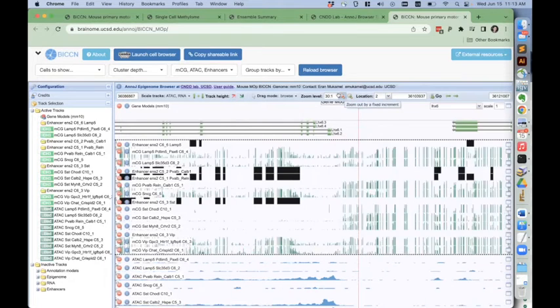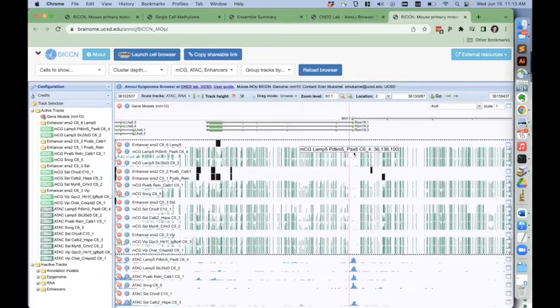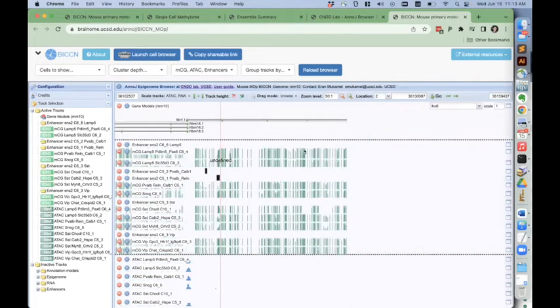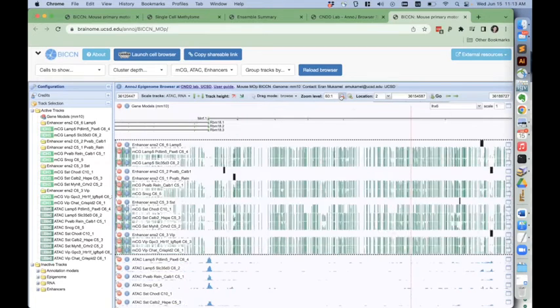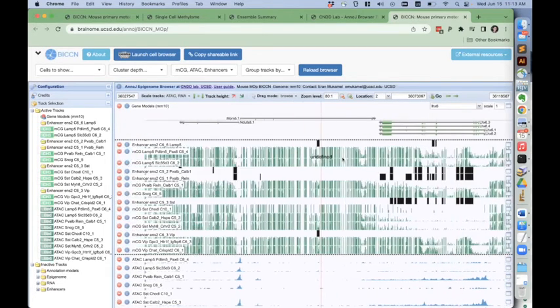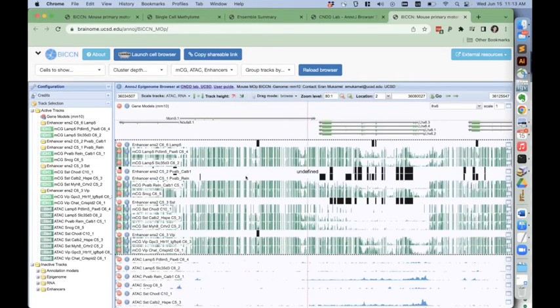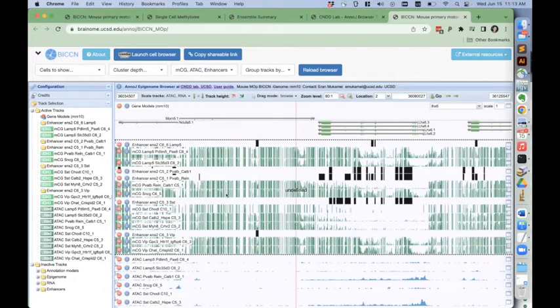If we zoom out and look at maybe some other promoters, you can see most promoters are unmethylated. So this is a promoter actually that's shared between two genes on the two strands, very low DNA methylation, and that's really a common feature across genes. But so we can see that here also if I put my cursor over this promoter. CG methylation levels throughout the rest of the genome tend to be high, so you can see almost everywhere else these ticks go all the way up.